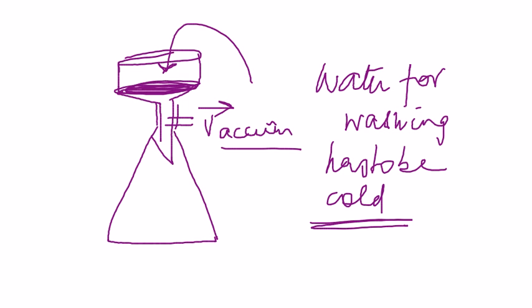And as you're doing that, you'll continue to allow the vacuum to pull off any free solvent. Usually this step, as always, takes about 5 to 10 minutes. And then you're going to just air dry your product.